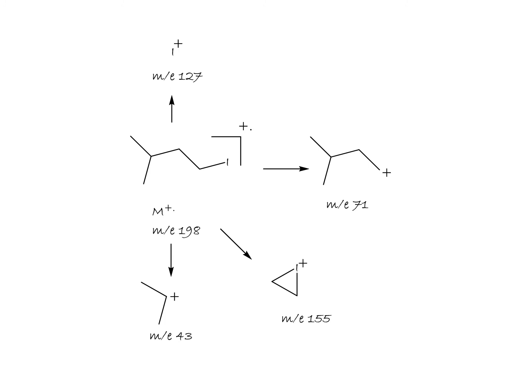Getting to this one, this is a radical carbocation molecular ion. Elimination of this part gives I plus, and of course this will be the radical.